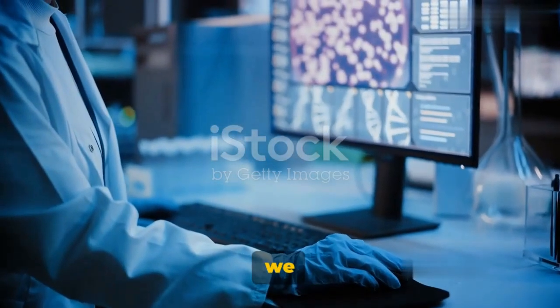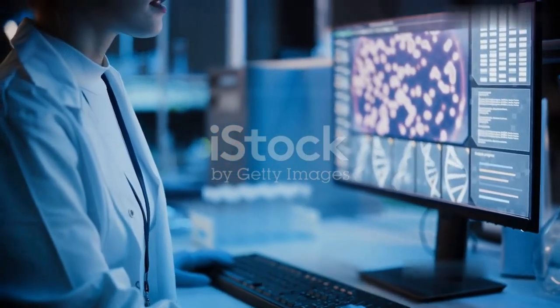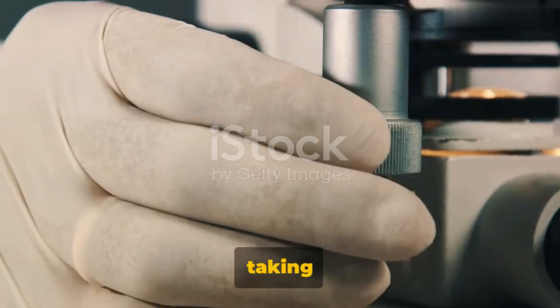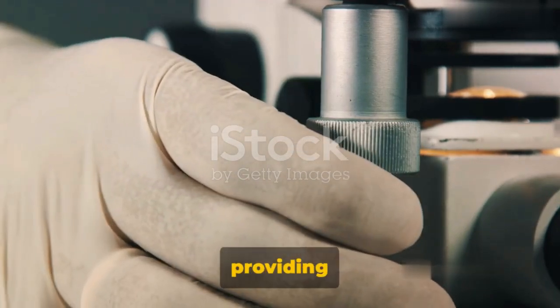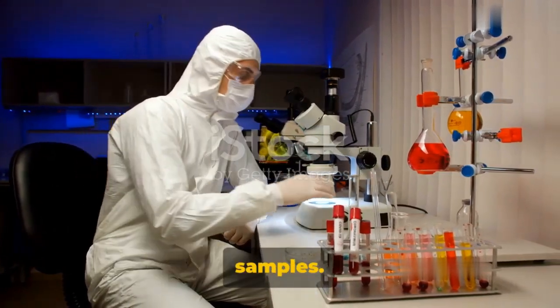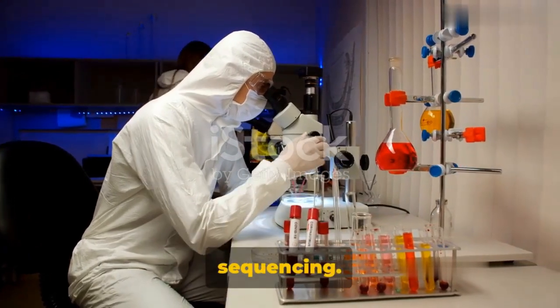Last but not least, we have RNA-seq, a method that's as intriguing as it sounds. RNA-seq is all about sequencing RNA and measuring expression by counting sequences. It's like taking a detailed snapshot of the RNA content at a given moment, providing us with a wealth of information about gene expression. The process starts with our RNA samples. These are then transformed into libraries ready for sequencing.